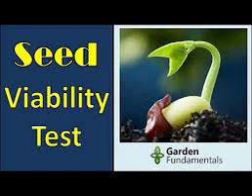Place seeds on 1.5 centimeter moist sand in a tray. Cover with the special paper. Cover it with 2 centimeter moist sand. Keep in a germinator at 20 degrees Celsius for 8 days. Count the seedlings emerged. The test is highly dependent on the quality of paper mentioned. This test should only be used for testing vigor when such quality of paper is available.